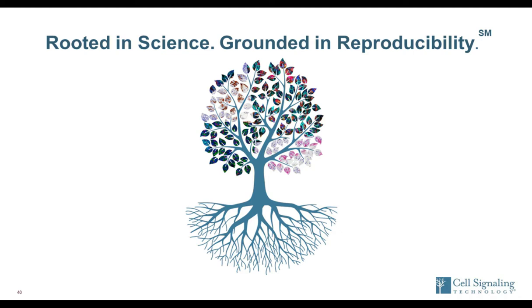Let's get started with our first question. Do you have any mouse antibodies or established panels for mouse tissue?